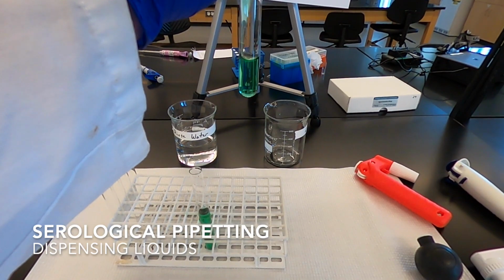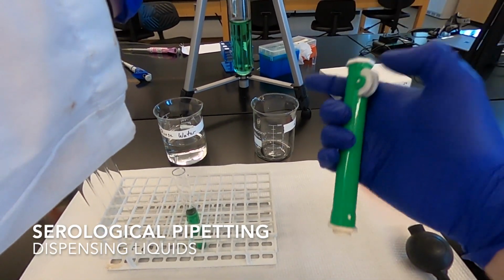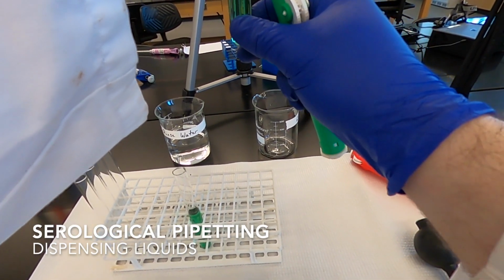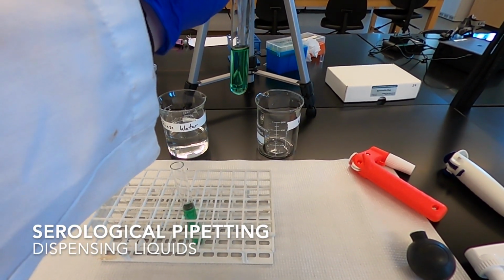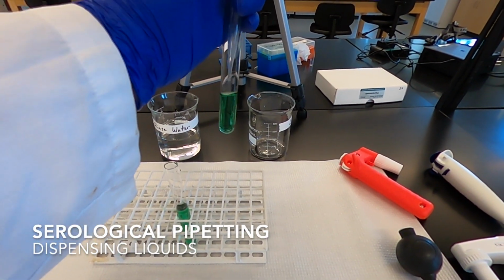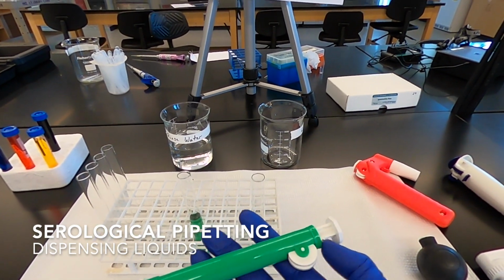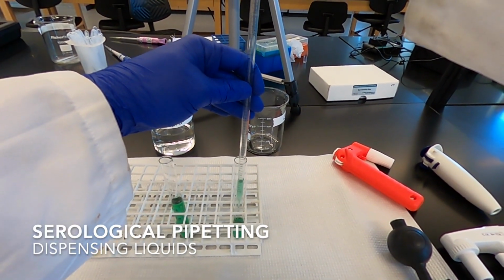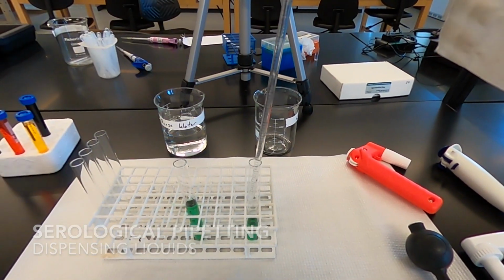Now I'm just going to get the rest of it out of there. Now notice how there is still some left in the tip. If you pipette up and straight back down, this is always going to happen. The pipettes are not calibrated for this, I think. So you do want to blow that out. If you just take your pump off and put it back on, just the act of putting it back on will force air through there. Alternatively, you can suck up air beforehand, so just pull up, make a little cushion, and then when you suck up the liquid, you'll have that cushion of air, so you'll still have force left to push it out. And notice that I'm doing a bad job here by not pipetting it along the wall.